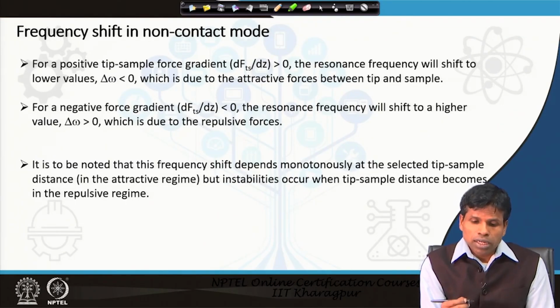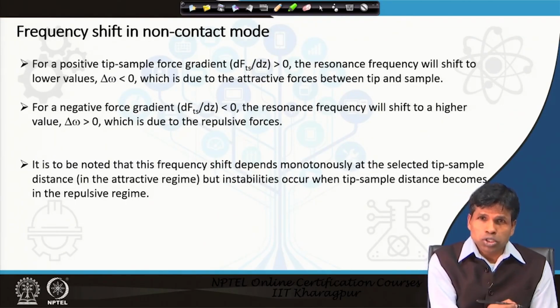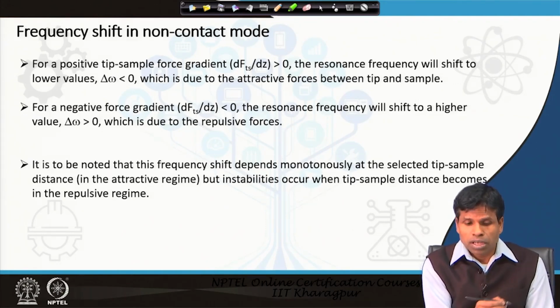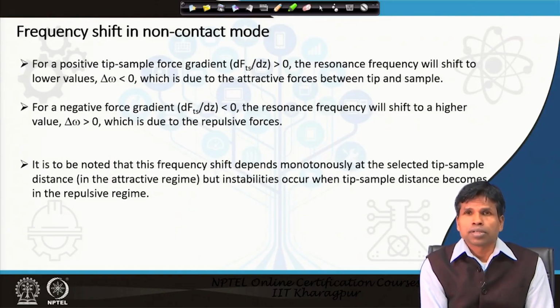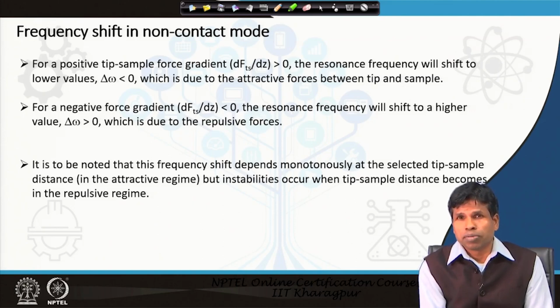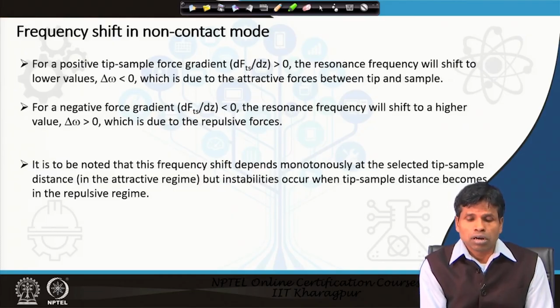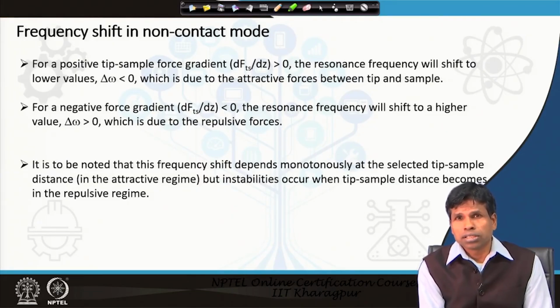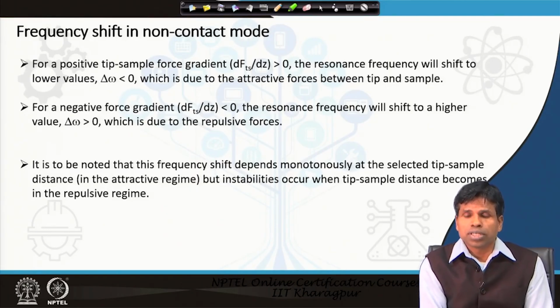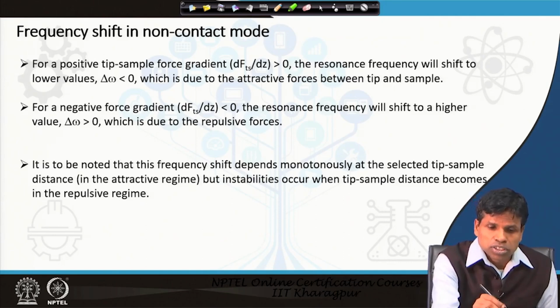However, when the tip comes close to the sample, meaning the repulsive regime, an instability occurs. The curve does not remain linear, the frequency shift becomes non-linear, and thereby this frequency shift concept cannot be utilized when the tip goes close to the sample, in the repulsive regime of the force distance curve.